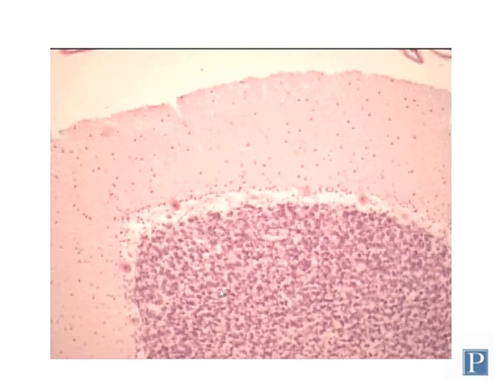At this magnification, you can really see the middle layer here. So this is a good place to describe these 3 layers. The superficial-most layer of gray matter in the cerebellum is called the molecular layer. It has a few neuronal cell bodies. There are some of them, but they're not densely packed together.